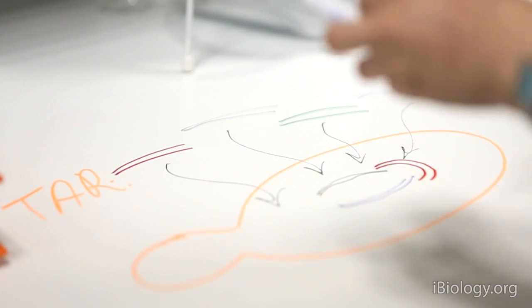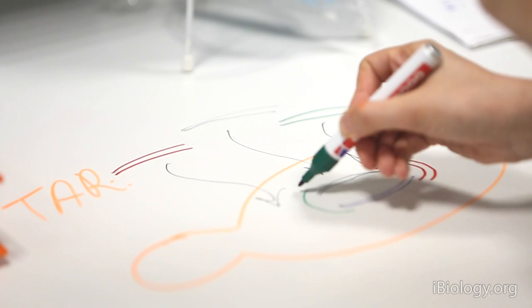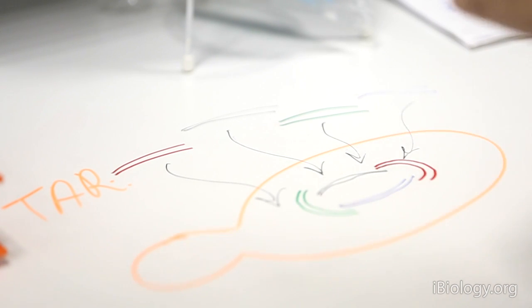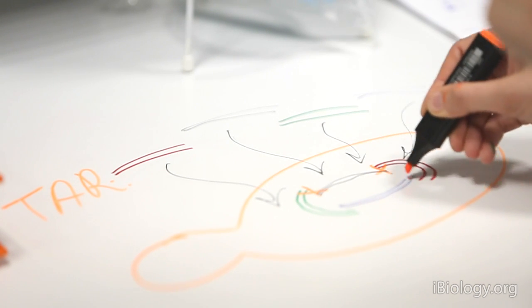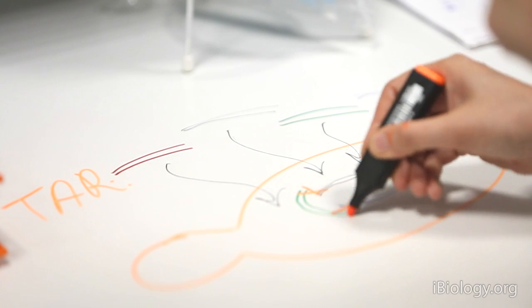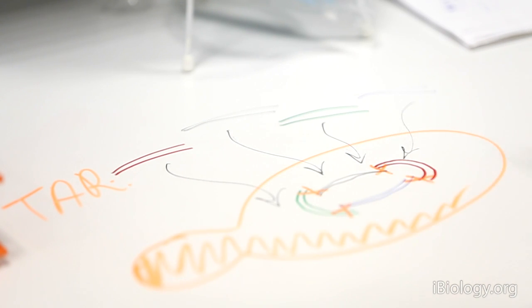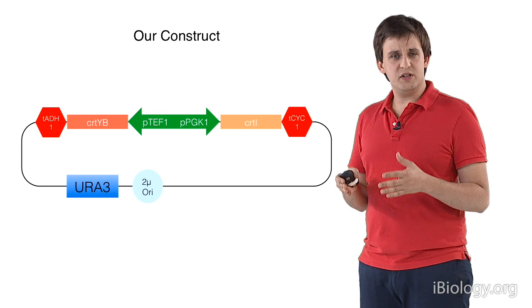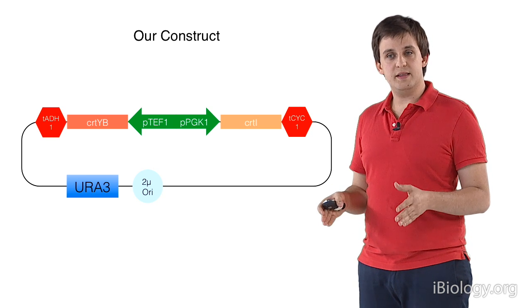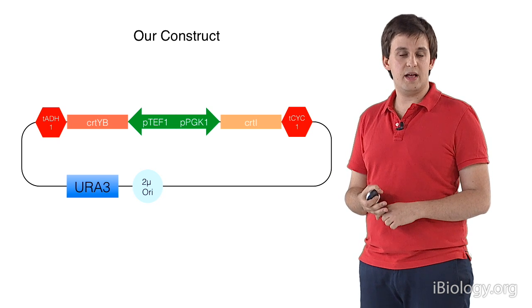In fact, we are using a unique property of yeast named transformation-associated recombination. And in fact, the homology regions of these 4 PCR fragments make it possible to assemble them in the circular form of a plasmid named episomal plasmid into the yeast cells. Now we have constructed our final construct, and we have the genes together with the promoter cassette and the terminators on one plasmid. We already transformed this into our cell.